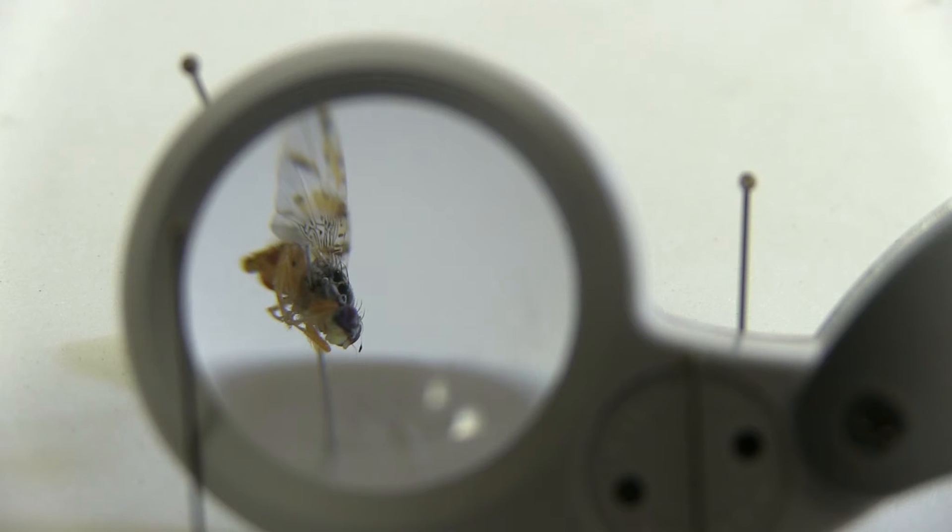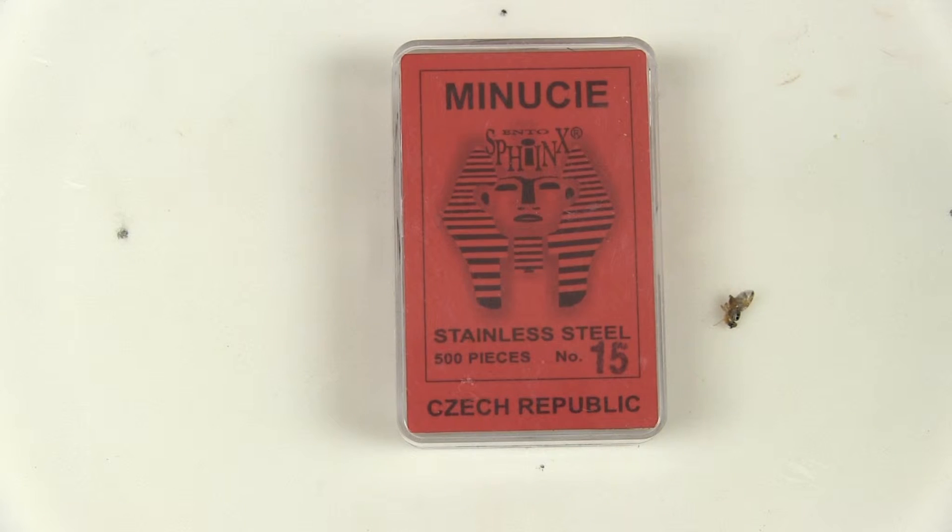For small, fragile insects like fruit flies or minute lepidoptera, the correct technique to use is double mounting with a micro pin.